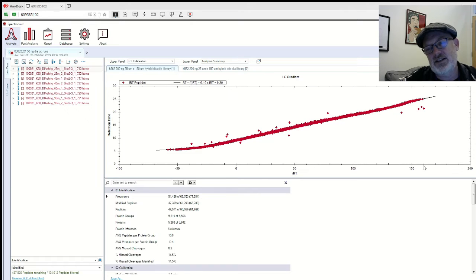It looks like it's around 160. And that goes all the way down to really hydrophilic peptides, which look like they go down to negative 100, negative 60. So it's like goal posting. It takes all the really hydrophobic ones, predicted by the amino acid sequence, and gives them the top numbers of 150.